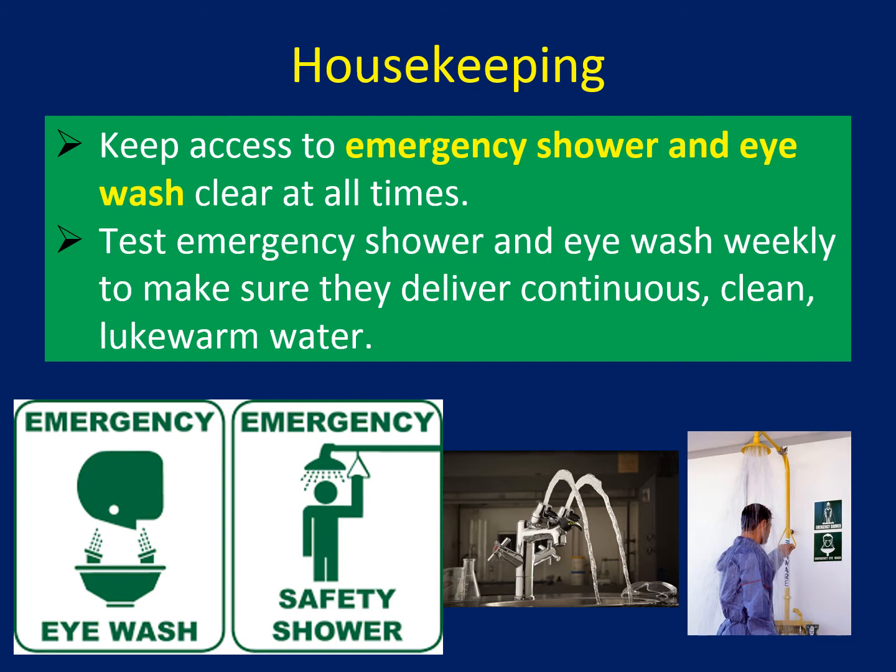So make sure that the emergency shower and eye wash are properly working, checked at least once a week, because in case of emergency it might not work, right? So these are the two symbols for the emergency eye wash and emergency safety shower. You have to identify those. Emergency eye wash and shower is available in our labs.